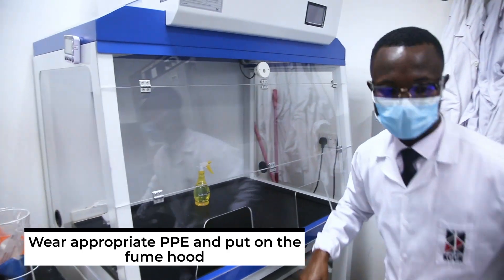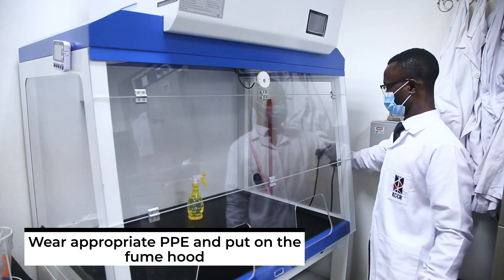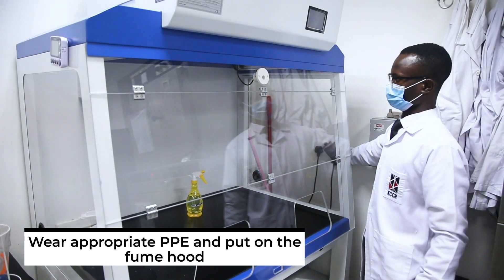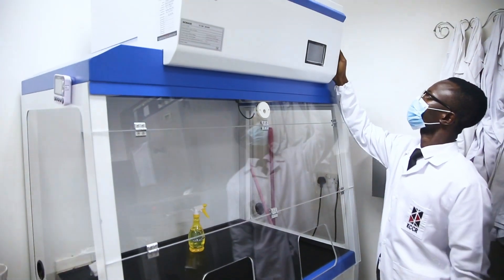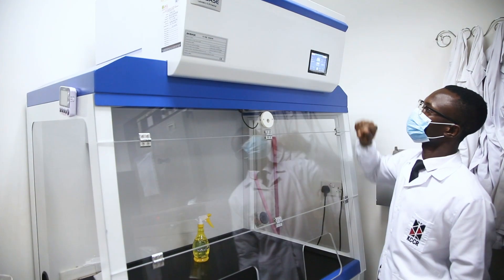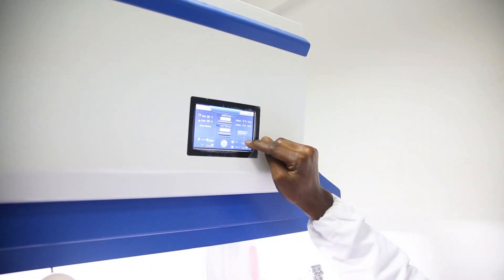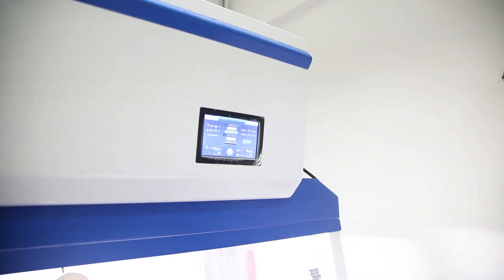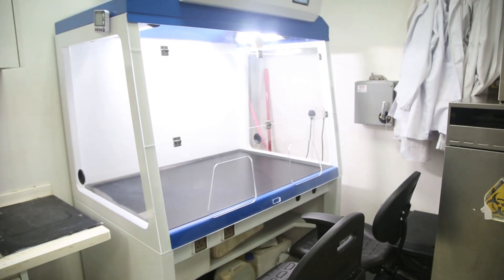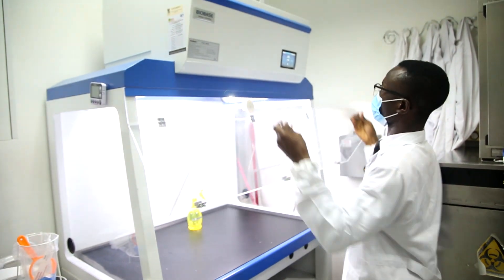The procedure. After wearing the appropriate PPE, put on the fume hood. The fume hood is a ventilated enclosure that keeps gases, vapors, fumes, and even some volatile radioactive compounds away from the user's face and prevents them from escaping into the rest of the laboratory. It filters the air to prevent the inhalation of toxic particles that can lodge in the lungs and cause serious health implications.